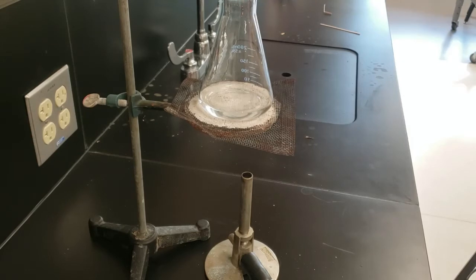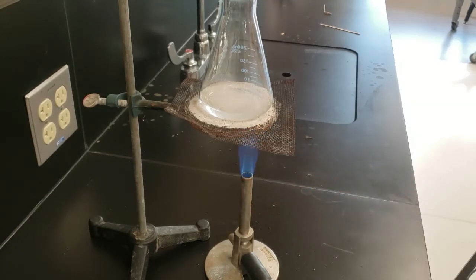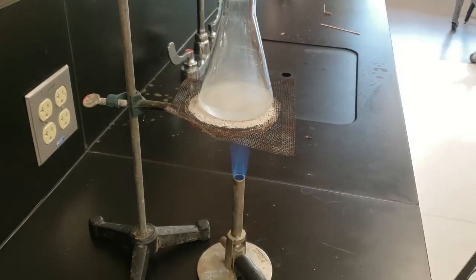And then I'm going to light my Bunsen burner. And I'm just going to make sure that that flame is at an appropriate height so that I don't end up overdoing it with the heat on the bottom of that.